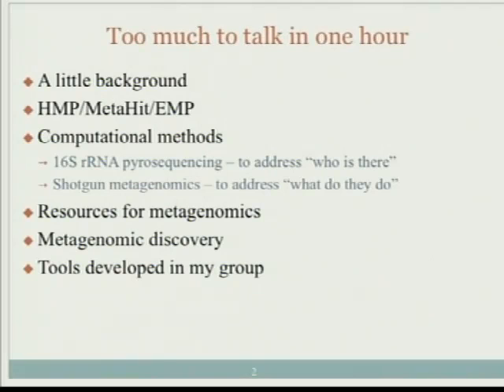But if you really care about what they do, you need to do shotgun sequencing. So actually, metagenomics is the RNA part? No, both. It can be 16S, depending on your purpose. In the earlier days, next generation sequencing was not so cheap yet, so you might just focus on 16S, because then you can go very deep if you only get reads from 16S RNA genes.